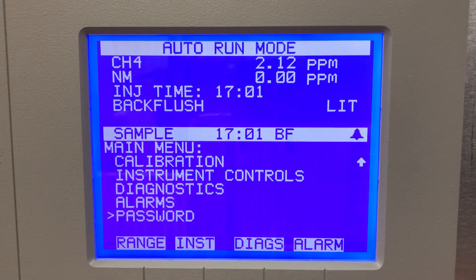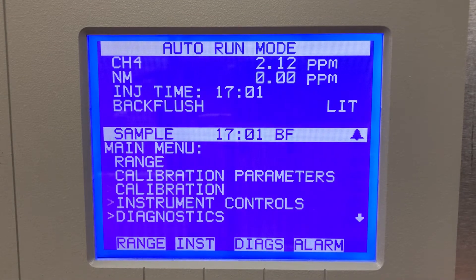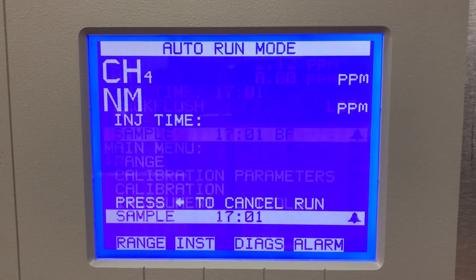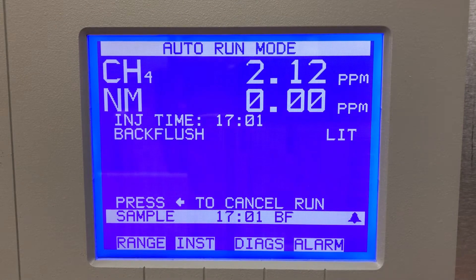And password protect. That's it on this unit. Back to the main screen again — you can see there's the methane and non-methane channel, and you can see it's going through the backflush right now, so that's for the non-methane components. Going to read — we're just reading zero right now, we're just on ambient air.